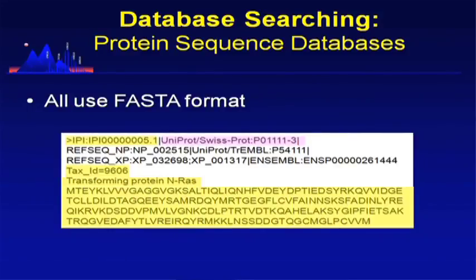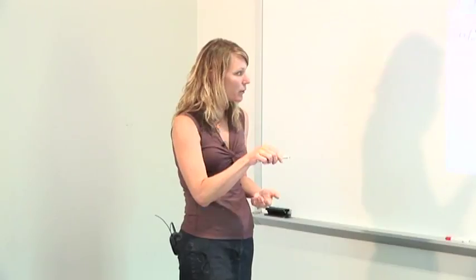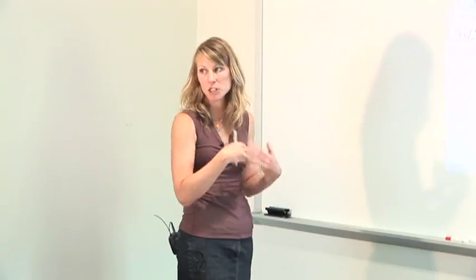This is important to know if you want to create a custom database or a custom entry to your database. Oftentimes someone will come to us and say, well, I have this protein, but I mutated it. So we go into the database and change one of the amino acids, or we just create a new entry.